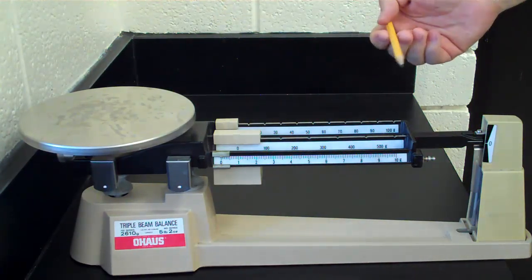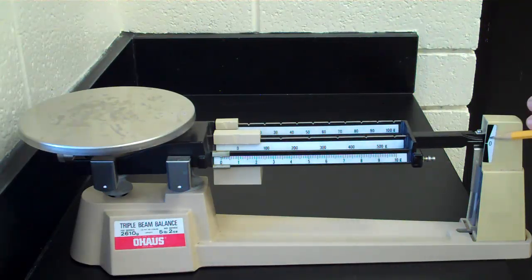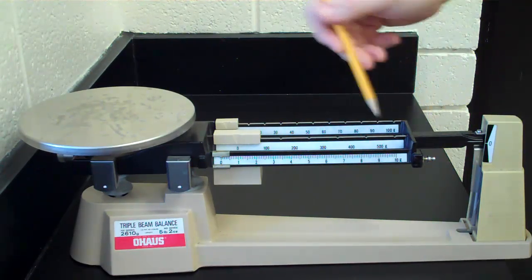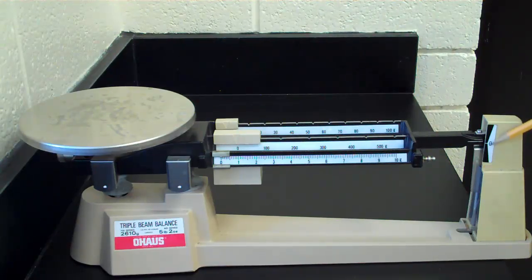First thing we want to do is make sure that the two white lines, there's a white line on the balance arm, and then there's a white line on this fixed point here.